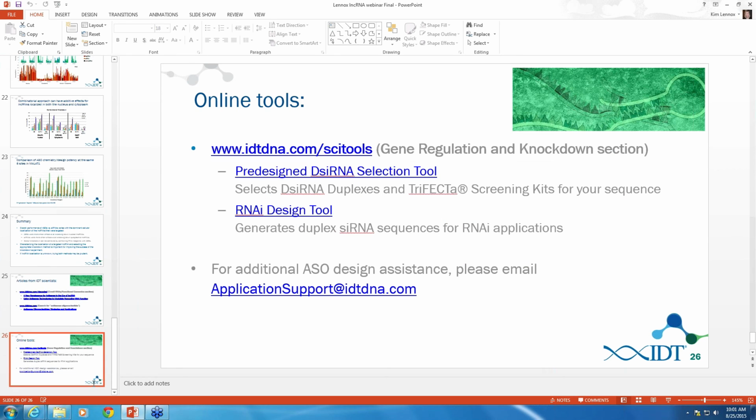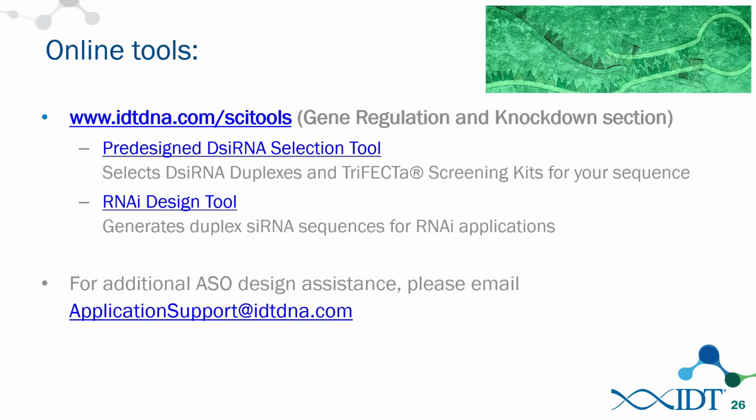And while you're going to that resource slide, I will ask the next question too. You measure the time point at 24 hours. How long after that does the knockdown last? Does expression resume after some period of time? It does. I have also tested it at 48 hours, and then for NRON, I also tested it at 72 hours. I was really determined to get NRON knockdown.